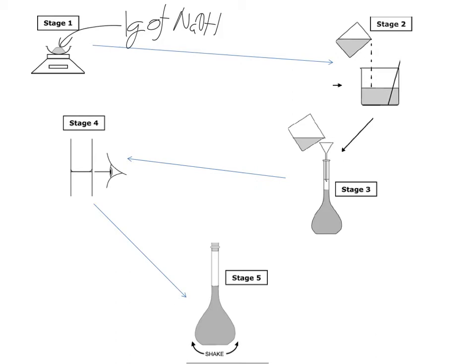There's no margin for error. So we need to make sure there is exactly 1 gram of that NaOH in that weighing boat. And we're then going to tip that into a beaker. So transfer 1 gram NaOH into beaker.